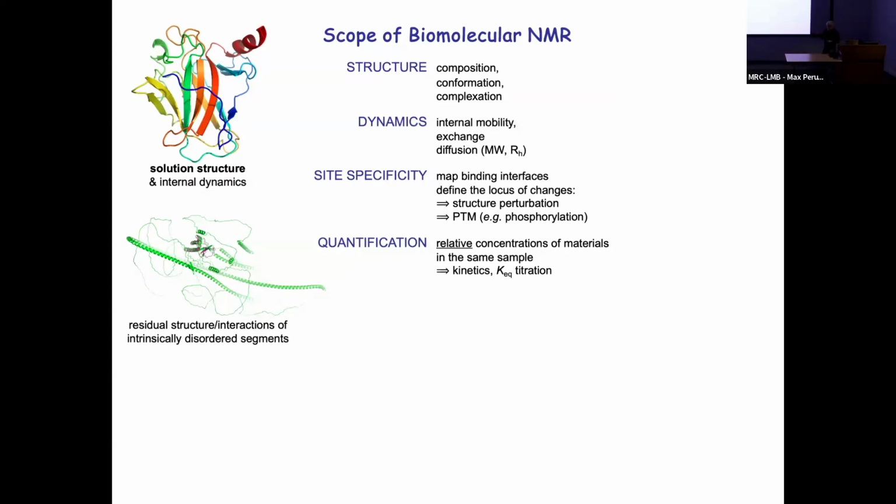But what NMR is really slow at is coming up with candidate structures, candidate folded structures that you then assess with the NMR data. Assessing a candidate structure is actually quite quick to do by NMR. We're talking now, we can cut the project down to a few weeks rather than several months.